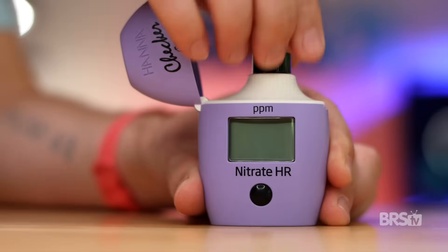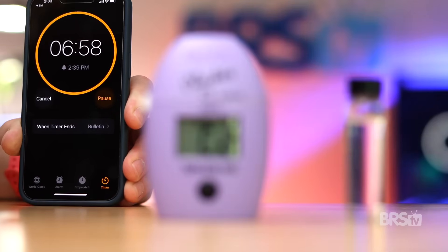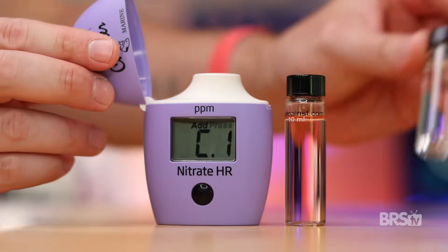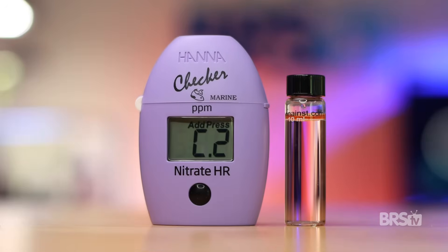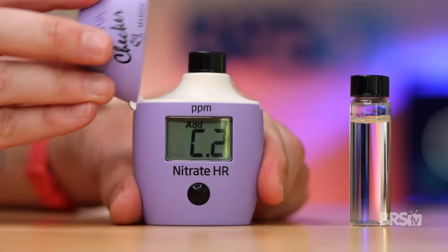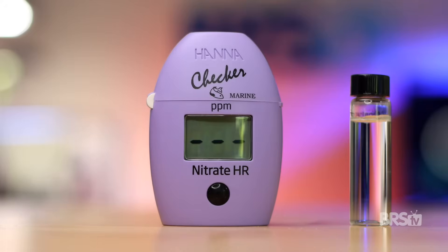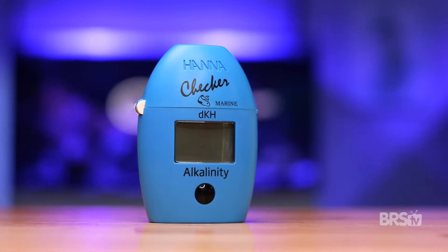Rather than start over and waste another reagent packet, here's what you do. Remove the cuvette and start a seven-minute timer on your phone. Grab the second unused cuvette and fill it with tank water. Press the button until C1 appears, add the new cuvette with just the tank water, close the lid, and press the button again. Once C2 appears, remove that cuvette and put the second cuvette with the reagent back into the checker. Wait until the seven-minute timer is up on your phone, then merely press the button and you're ready. I have to do this at least once a month because I'm also using the alkalinity checker, which doesn't have that seven-minute timer.